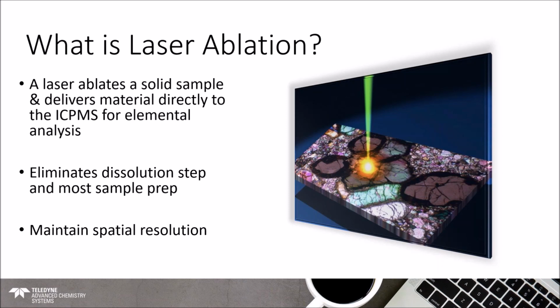So this is in direct comparison to the traditional elemental analysis by aqueous ICP-OES or MS. The difference essentially being that we get to avoid the entirety of the dissolution step that comes first. So we're able to avoid the digestion with acids.